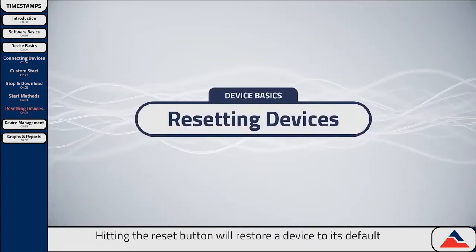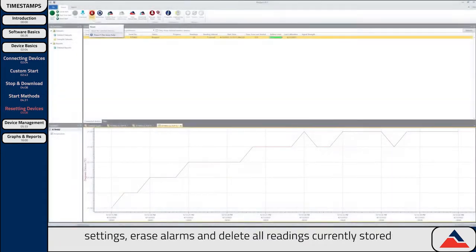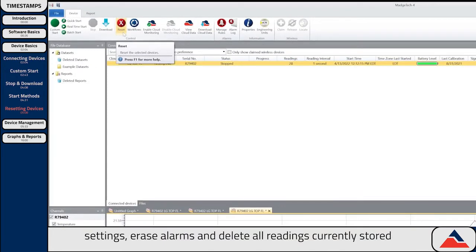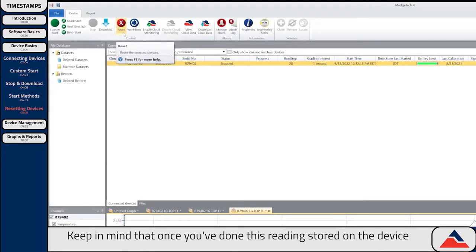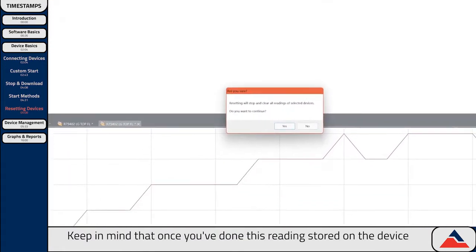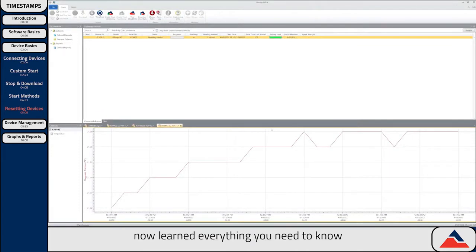Hitting the Reset button will restore a device to its default settings, erase alarms, and delete all readings currently stored on the device. Keep in mind that once you've done this, readings stored on the device cannot be retrieved, so ensure you've downloaded all necessary data before doing a reset. And with that, you've now learned everything you need to know in order to use your device to record data.